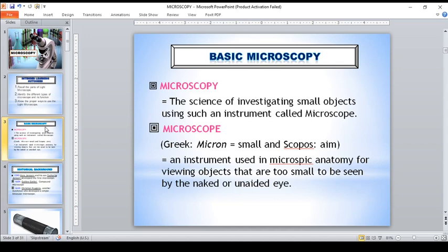That's why we utilize the microscope to check if samples have pathogenic bacteria, like for example in microbiology. A patient suspected of having a urinary tract infection is required to submit what sample, guys? Stool ba yan? Synovial fluid ba? CSF ba? Of course not. It should be urine to assess urinary tract infection.